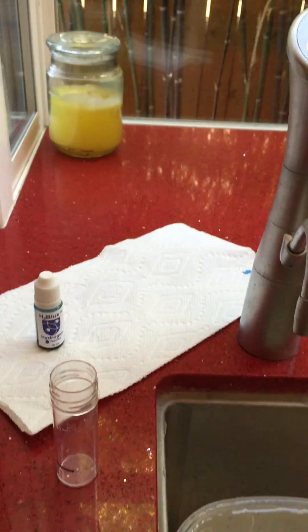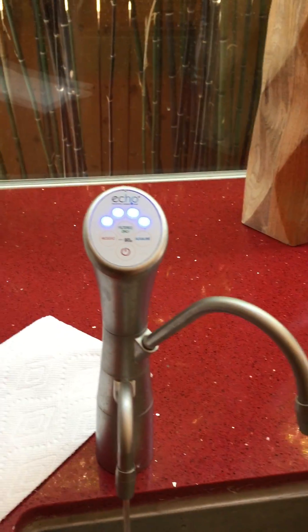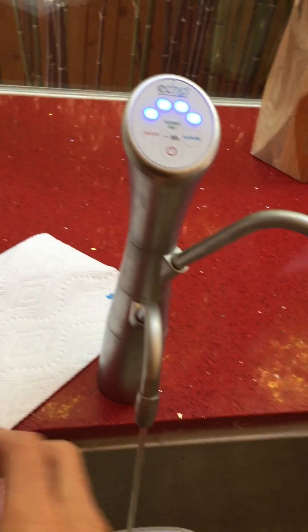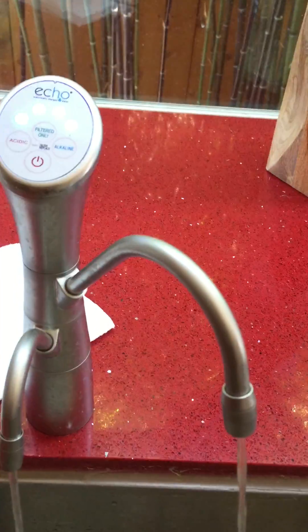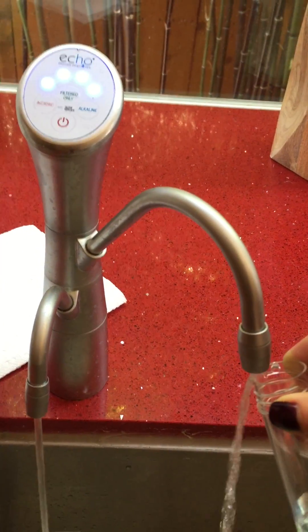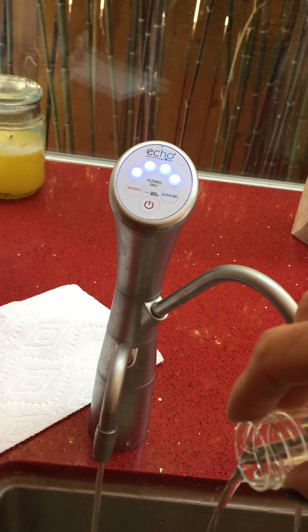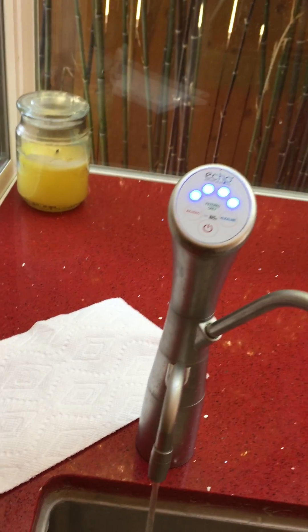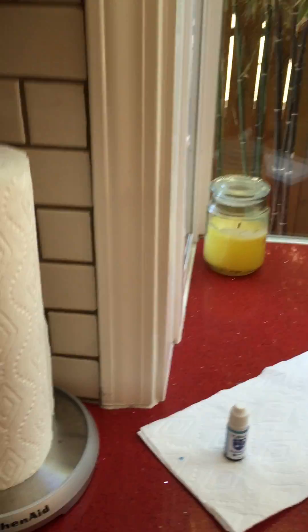Now what I'm gonna do is put six milliliters of water in there. I'm gonna let the water run for just a few seconds first, and okay, let me just let it run for another second and we'll fill this to the six milliliter line. It's a little above so I'm going to pour some out — okay, that looks about right.